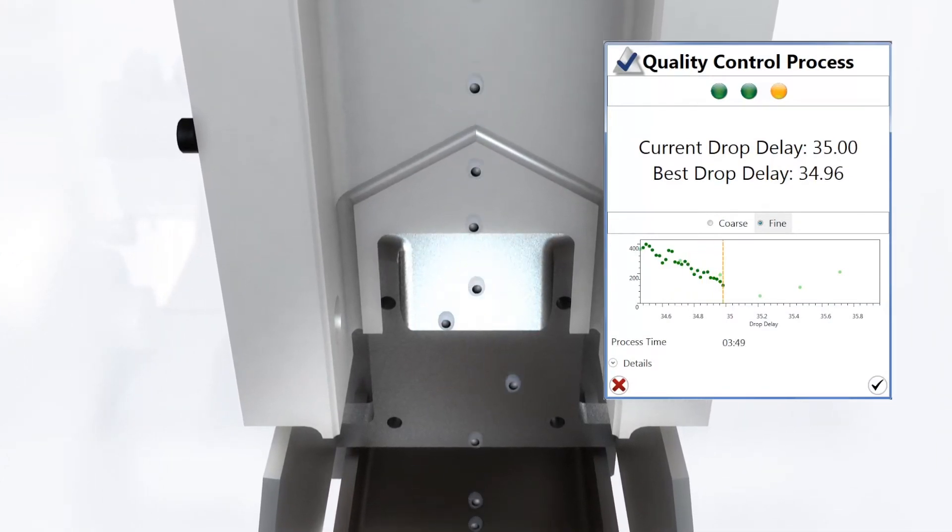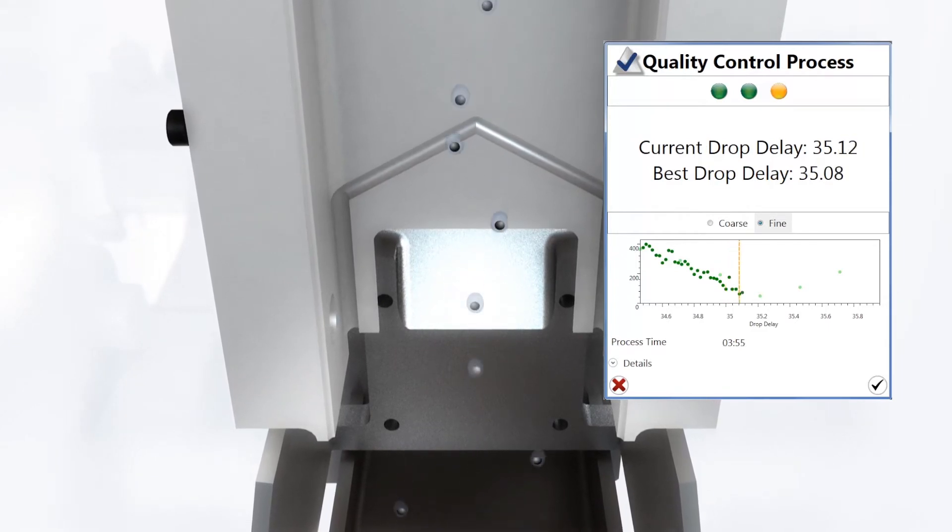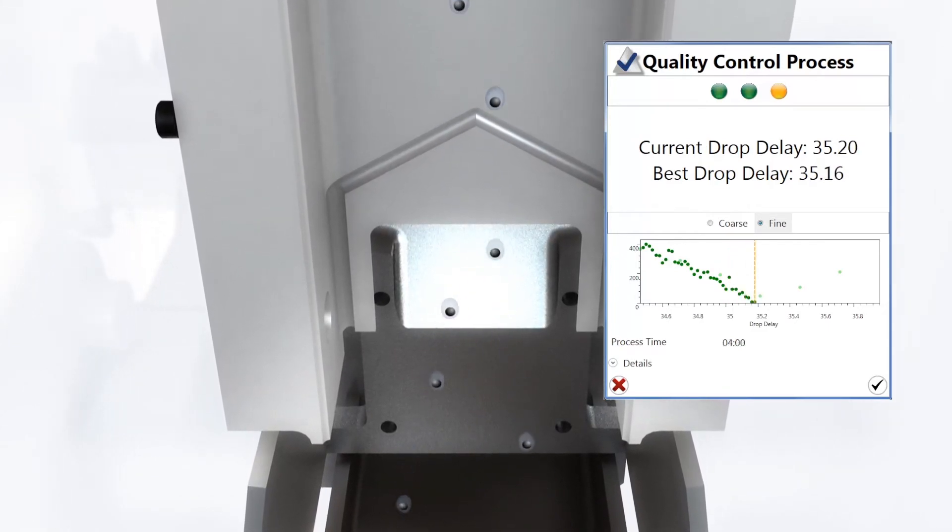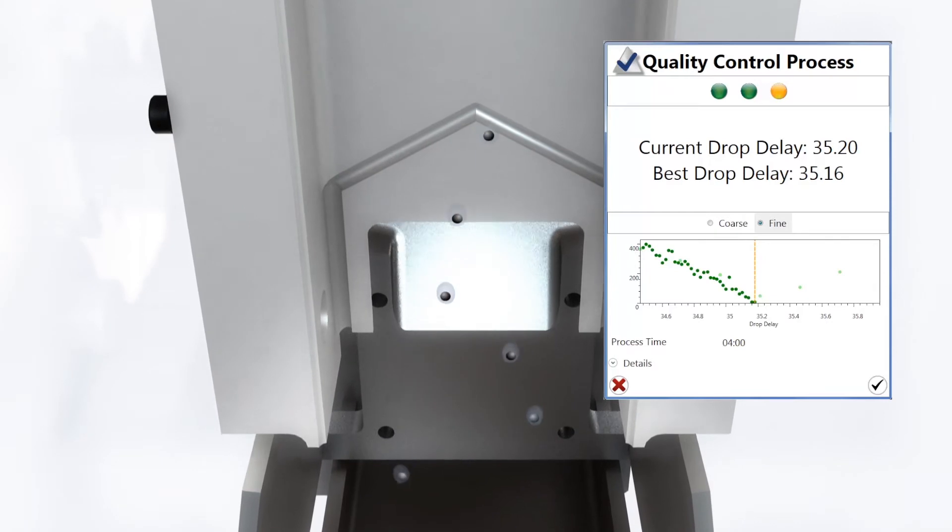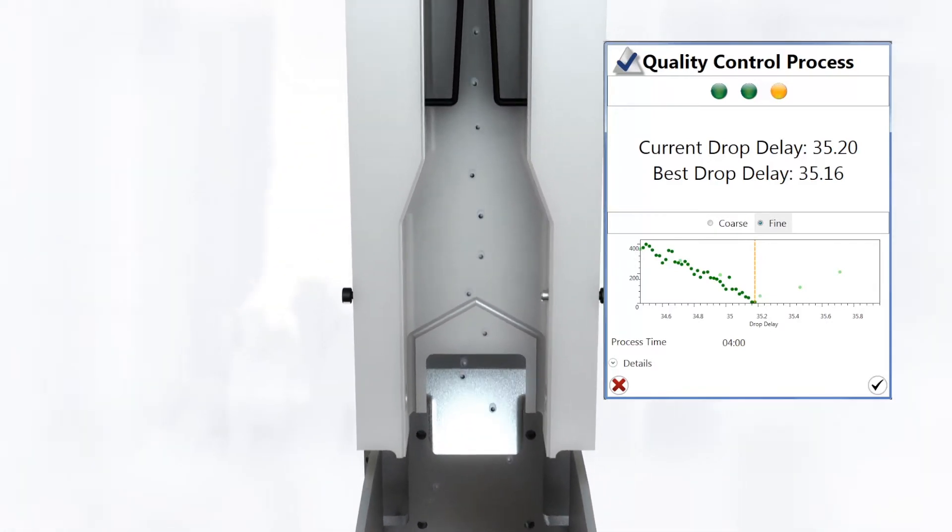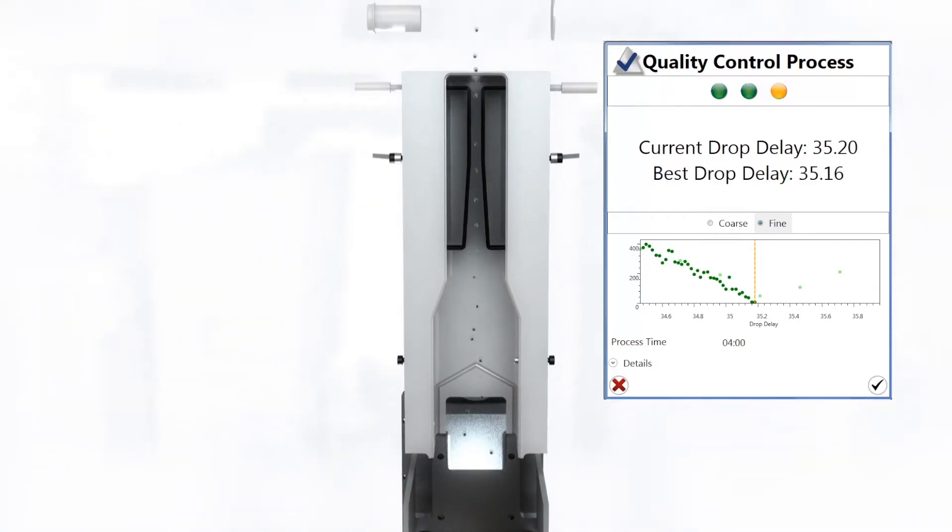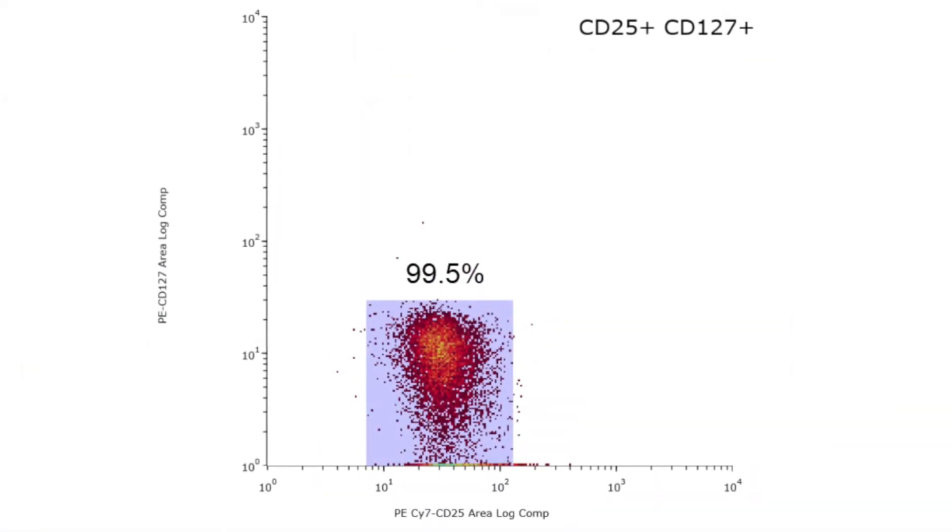ProDrop technology automatically fine-tunes the drop delay until QC beads are no longer detected within the waste stream, confirming that charged droplets are being sorted accurately. ProDrop and jet-in-air means you get the most pure, viable cells out of your precious samples.